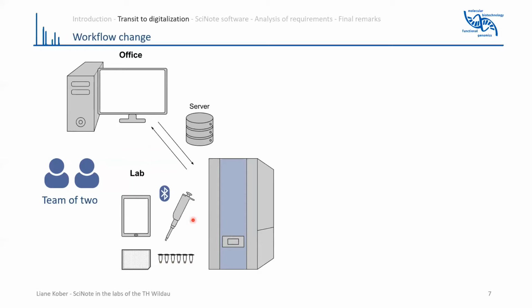And in the lab, the pipette is connected via Bluetooth with the tablet, and all pipetting steps, so all volumes, the aspiration, the dispensing, mixing steps, are mainly performed automatically. The only task the user has to do is to move the pipette to the right position.